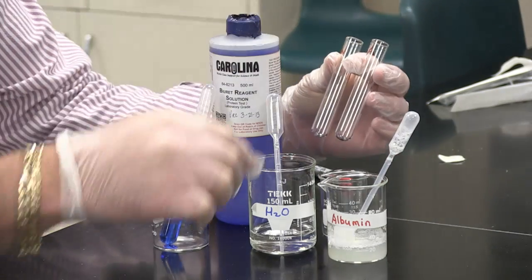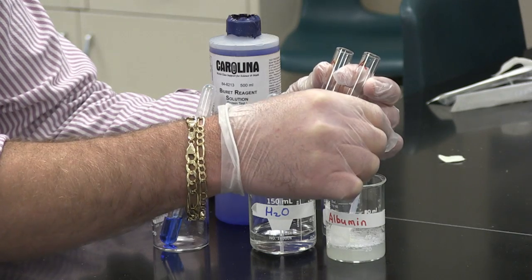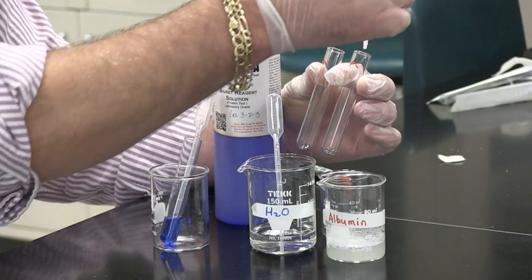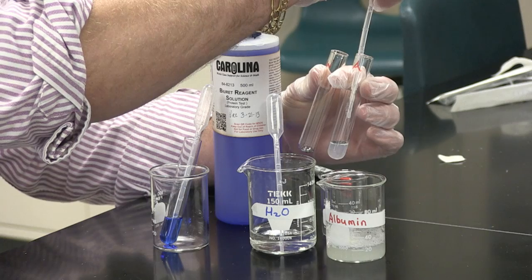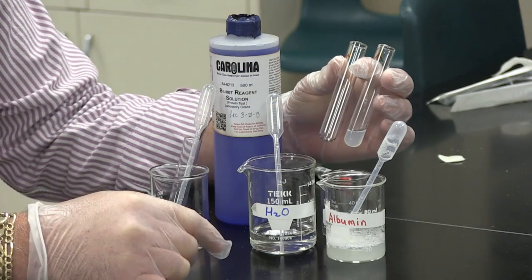I have two test tubes — one marked with an A and one marked with a W. In the test tube marked with an A, I am going to put in one dropper full of an albumin solution.